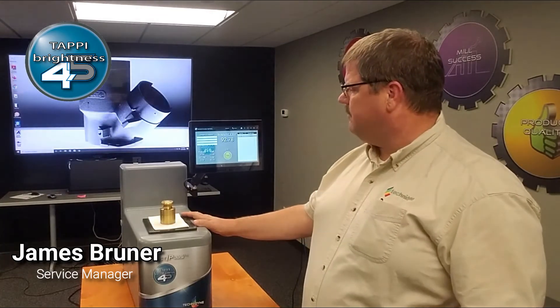Other apps available for this instrument, in addition to the statistics app, include the fluorescence app, the database app, and the export app. The export app will allow you to download your readings to a thumb drive or export them through a Wi-Fi or Ethernet connection.